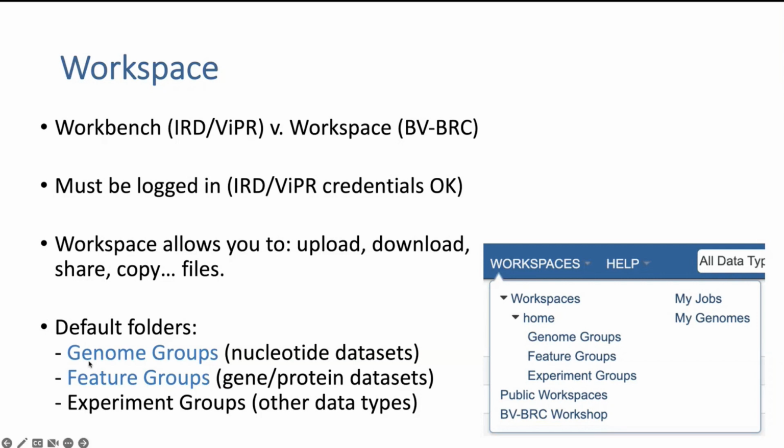And then just to compare the workspace versus what was known as the Workbench in IRD, I should mention that you do have to be logged in to use these tools, so that you can upload your data to the workspace. But if you are a previous IRD or Viper user, your credentials should still work for this site. So you can just log in with the same ID and password. And using this workspace, you can do the same things that you could do in IRD, including upload and download your own files, share them with other users, copy them, and so on and so forth.